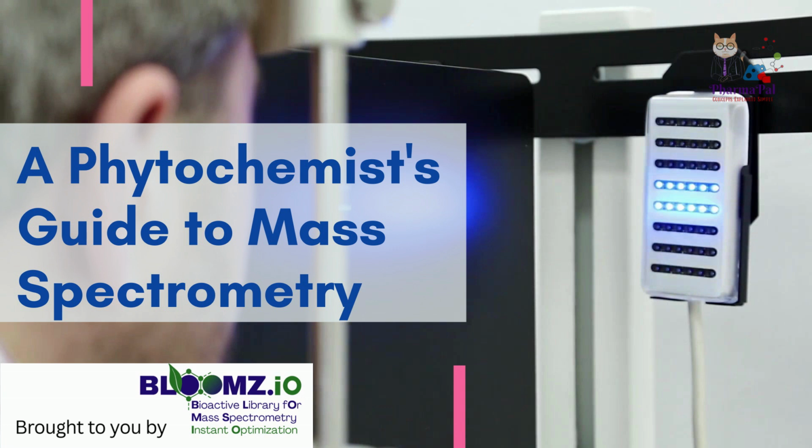So it's like having a much finer scale to weigh those molecules. Sort of, yeah. It gives you a much more accurate mass measurement, and you also tune things like the mass range or scanning, or collision energy if you're doing fragmentation, tailoring it to the types of molecules you expect or are looking for. So it's very targeted. You need an idea of what class of compounds might be active, flavonoids, alkaloids, whatever, to optimize the analysis. It certainly helps. Knowing the likely chemistry guides how you set up the experiment for the best sensitivity and information. You're optimizing detection and identification for your specific goal.